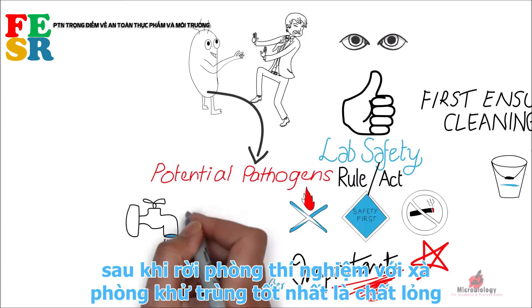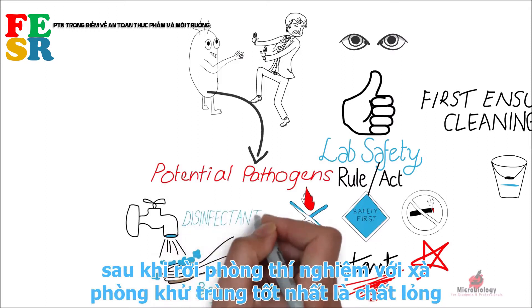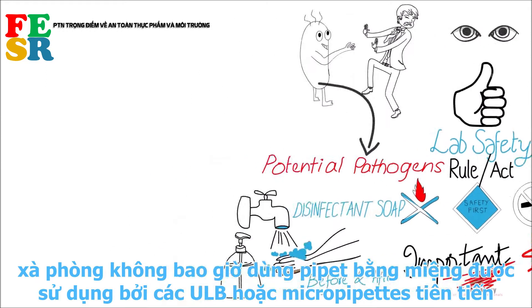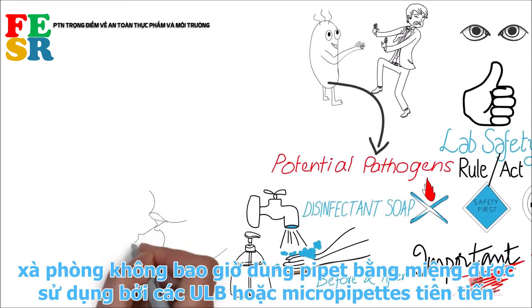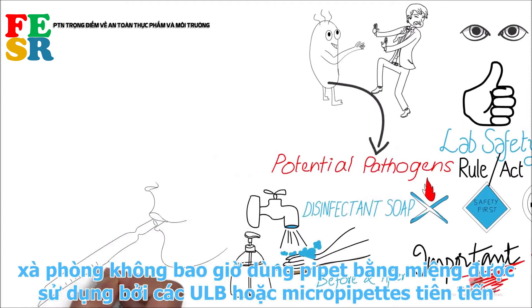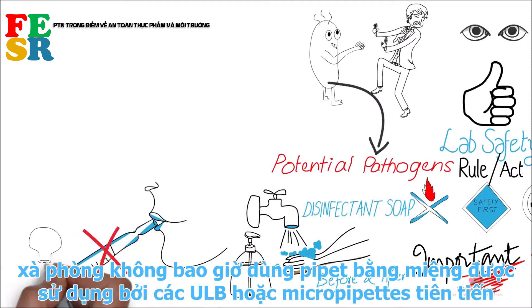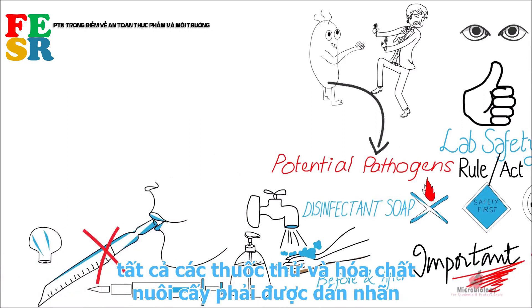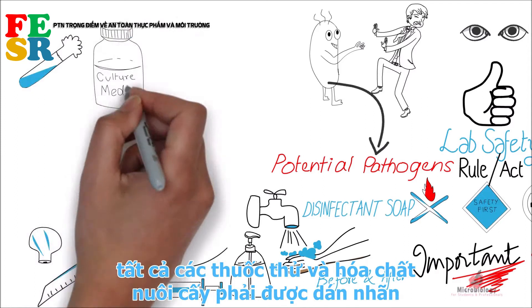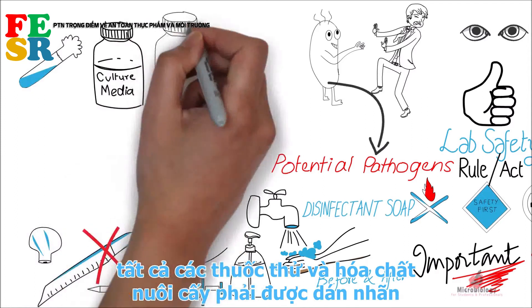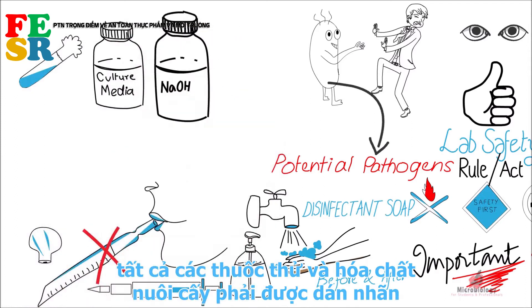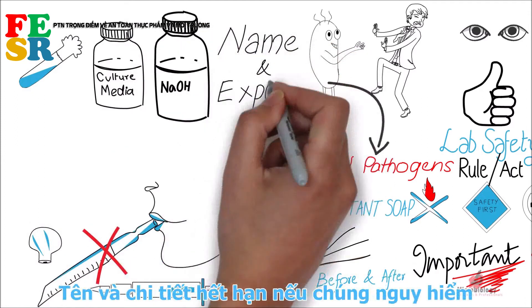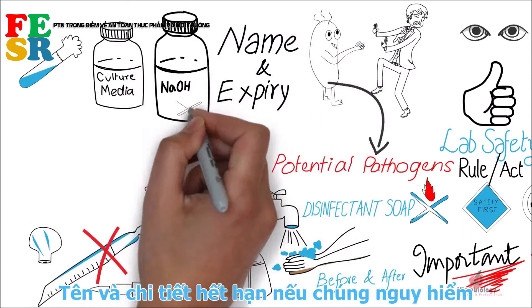Wash your hands before entering and after leaving the lab with a disinfectant soap — preferably a liquid soap. Never pipette by mouth; use bulbs or advanced micropipettes. All cultures, media, reagents, and chemicals must be labeled with their name and expiry details.